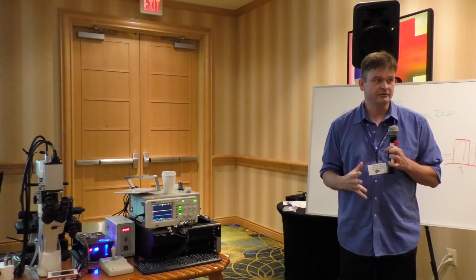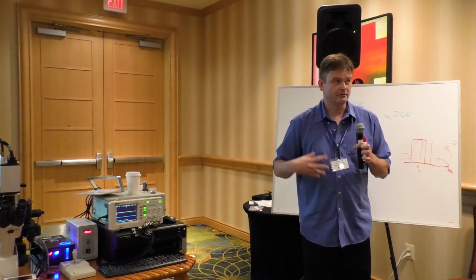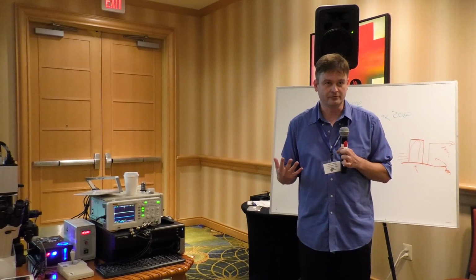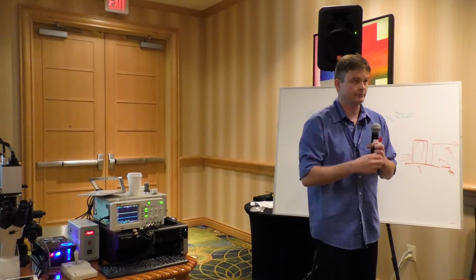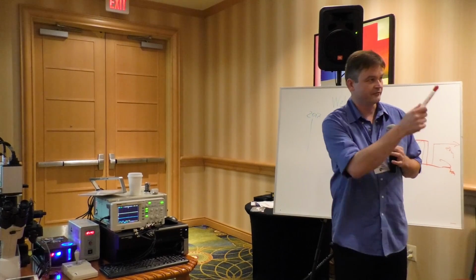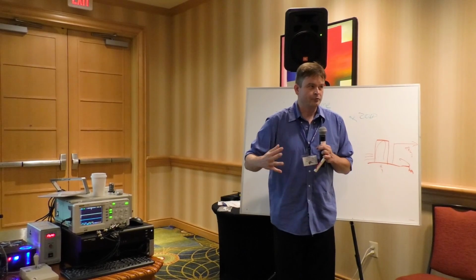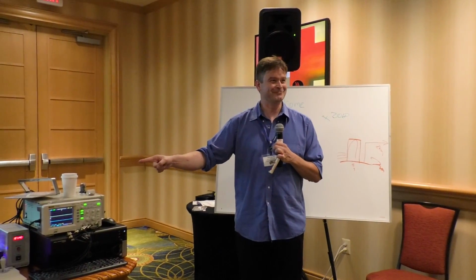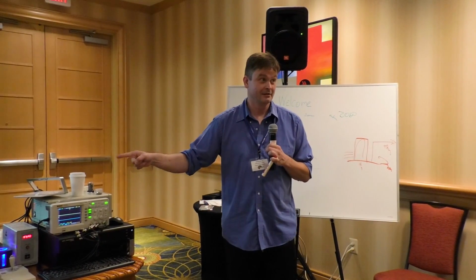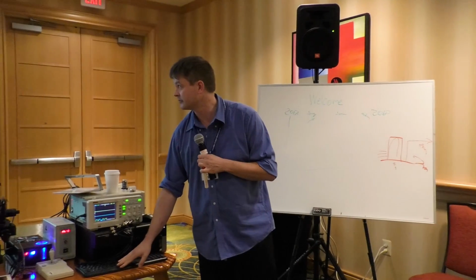Photons have Poisson statistics, photons have properties that we can use to do analysis. The detector has properties we can use to do analysis. All of a sudden, we can make estimates like here, we have Bernd Rieger again here, we have Beversdorf here. That's where I push the limits of saying, hey, this is a machine. And actually, we know what it does. We can measure what it does. Let's use this extra information and pull and push more data out of our data.